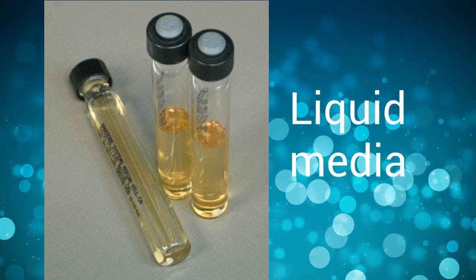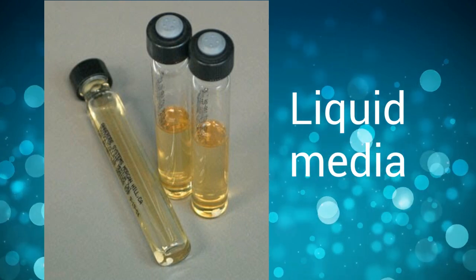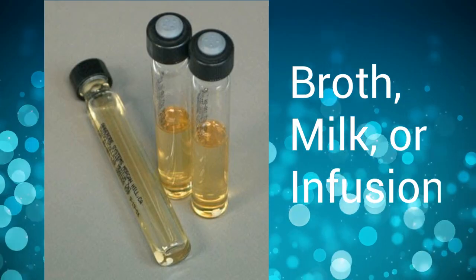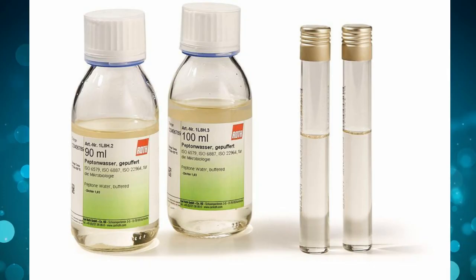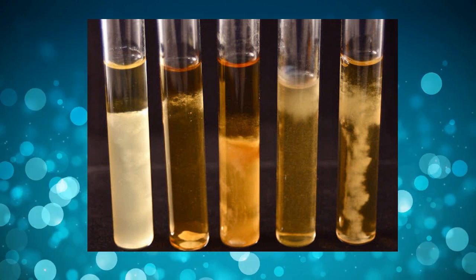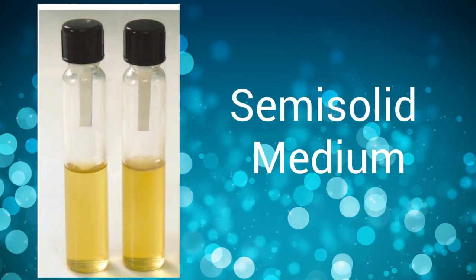The liquid media are water-based solutions that do not solidify at temperatures above freezing point and tend to flow freely when the container is tilted. We use the term broth, milk, or infusion for them. They are made by dissolving various solutes in distilled water. Growth of microbes occurs throughout the liquid medium and can appear to be dispersed, cloudy, or particulate. Examples of liquid media include nutrient broth that contains beef extract and peptone in water.